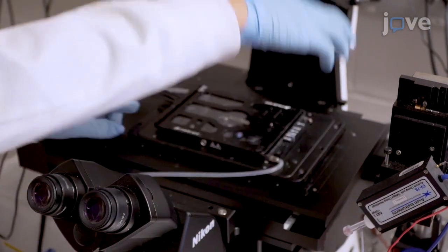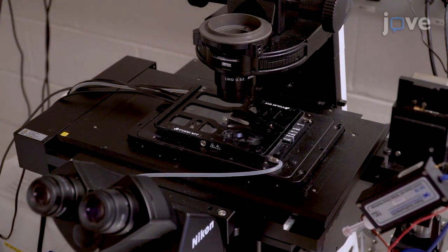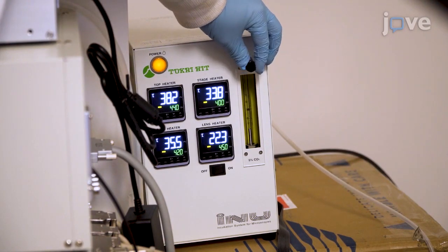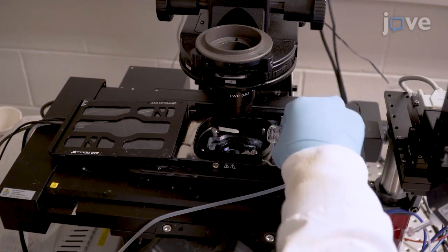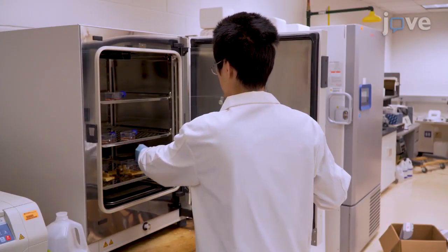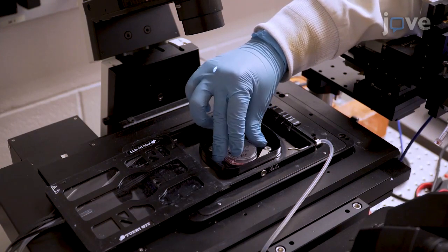Begin by placing the environment chamber onto the motorized stage of the inverted microscope. Set the CO2 flow rate to 160 milliliters per minute and adjust the temperature of the chamber. Then add 40 milliliters of purified water into the bath of the chamber. Take out the glass-bottom petri dish with cells from the incubator and place it in the environment chamber.